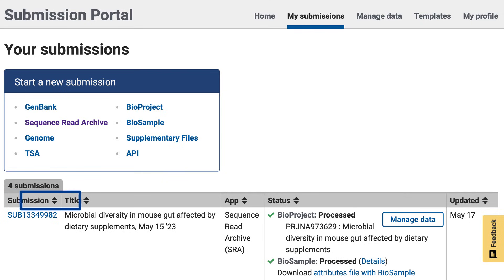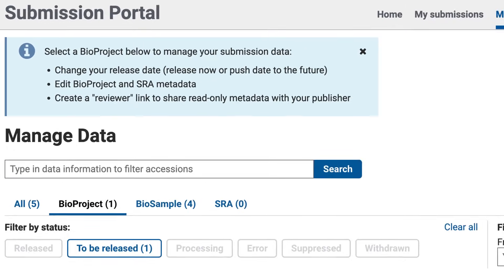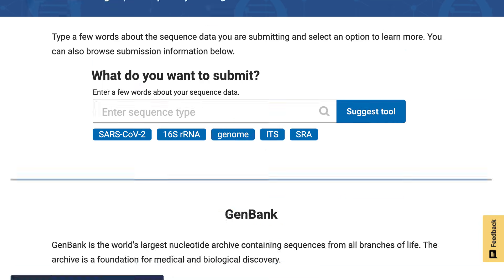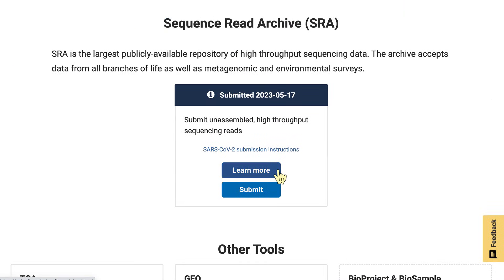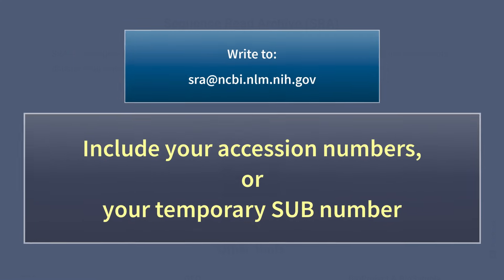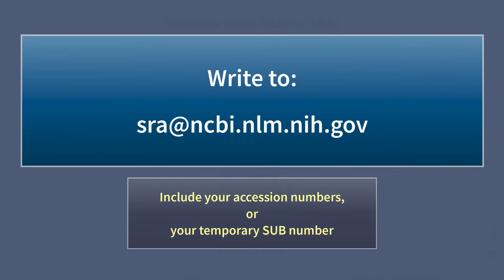I now see my submission and its status on the My Submissions page. After your submission is processed and accessioned, you can use the Manage Data page to change your release date and edit metadata. That's it for this tutorial. If you need help, you can follow the link to Home, scroll down to the SRA section, and click the button Learn More. For further help, please email us. When emailing, be sure to include your accession numbers, or if you do not have those yet, your temporary SUB number. Write to sra@ncbi.nlm.nih.gov.